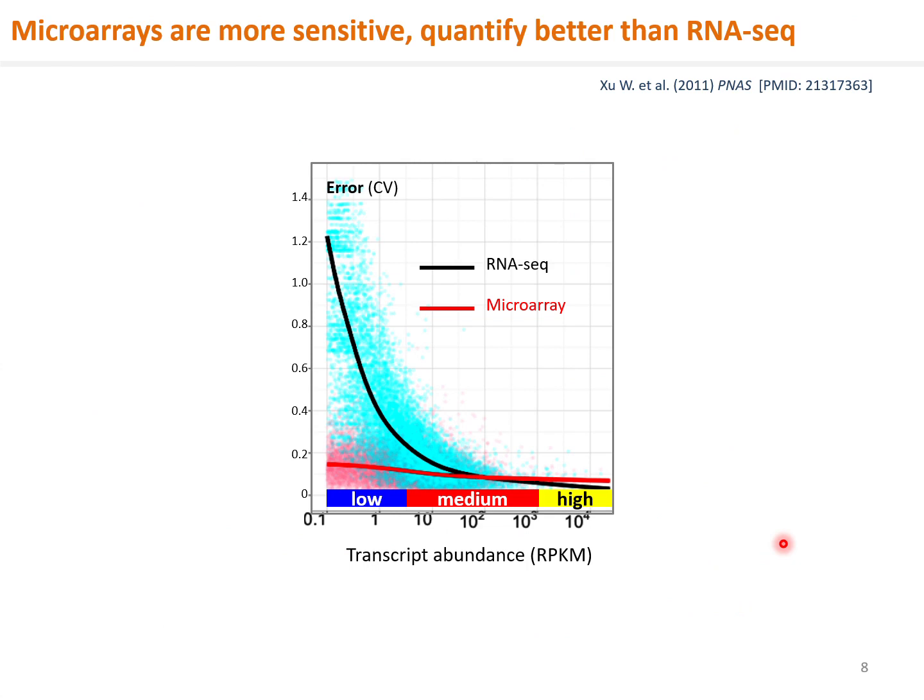This limit of RNA sequencing for low abundance transcripts is well known. In fact, there are commercial kits trying to get around this problem by using so-called targeted RNA sequencing, where enrichment of low abundance RNA by hybridization oligos or PCR amplicon panels is used to get low abundance transcripts enriched and sequenced. But by doing enrichment then sequencing, you will have to go through the trouble of extra procedures and the errors and biases introduced with them.